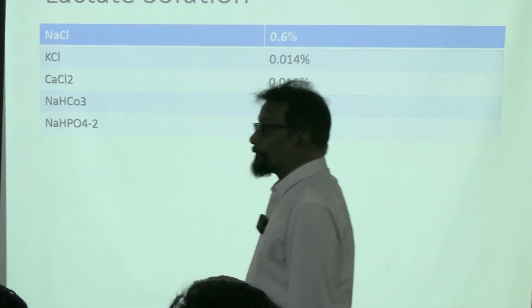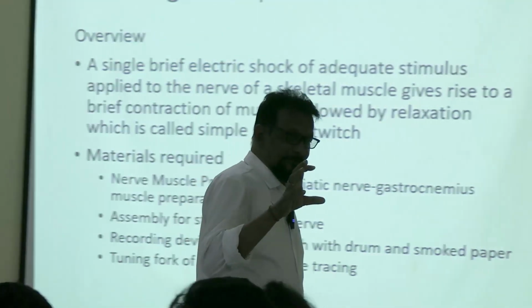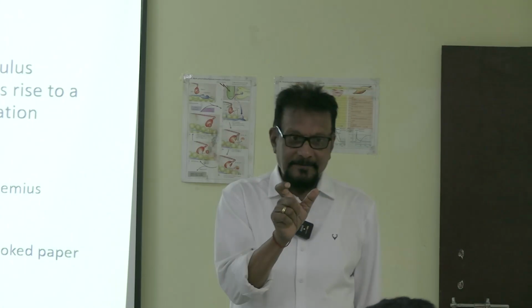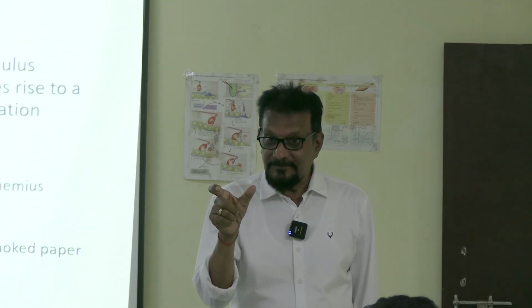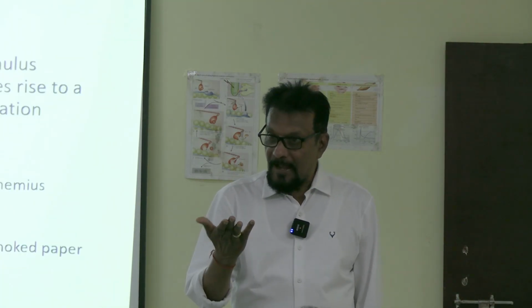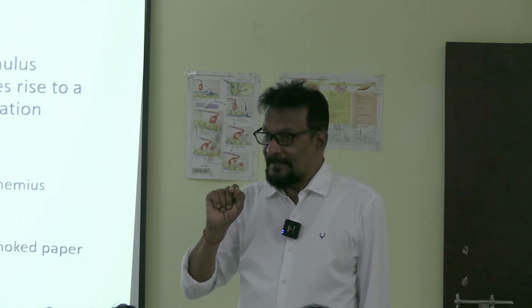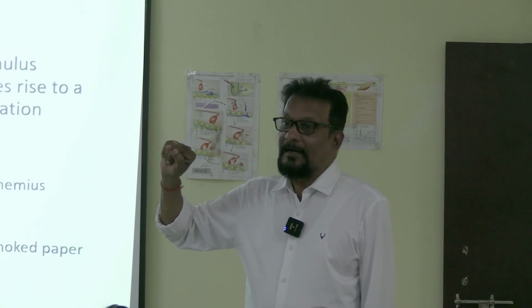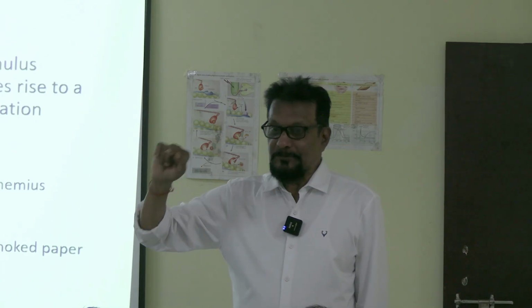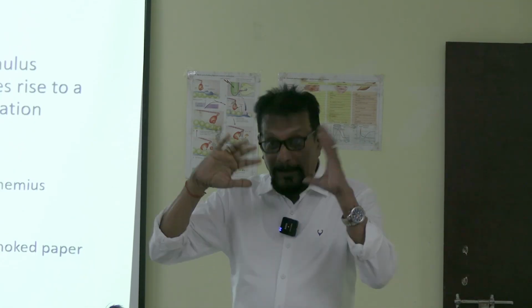Is that clear up to here? Okay. Now we need an experimental setup. The first thing we need is the prepared nerve muscle preparation, and how it is prepared, we came to know. Next is the stimulation setup: how we will be stimulating the nerves. And the third is the recording setup.